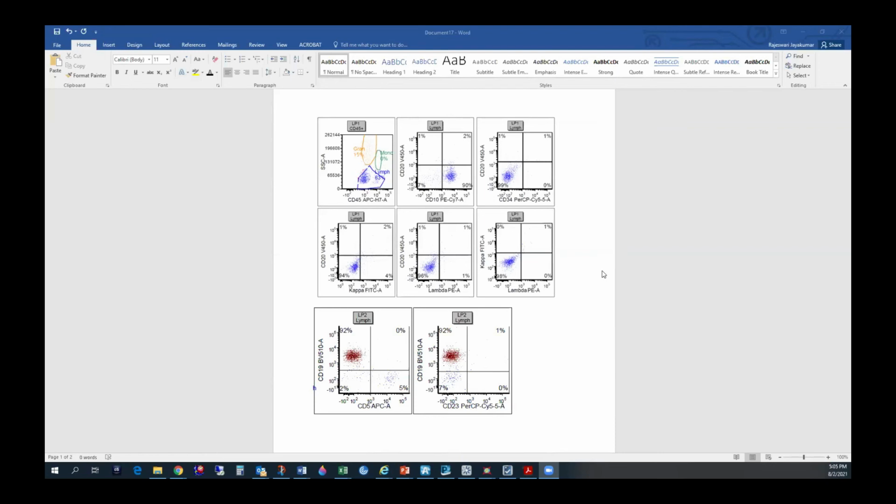And he had an additional MYC translocation and TdT was very brightly positive, but we did it in the immunostain. We did not do it in the flow because we ran out of tissue. But the clue is side scatter versus CD45, it is sitting here and it does not have surface CD20 despite the patient not being treated with rituximab for 2 years. That's what I first thought. But then the lack of surface light chains and presence here kind of made us feel like, no, this is not follicular lymphoma, this is something else.